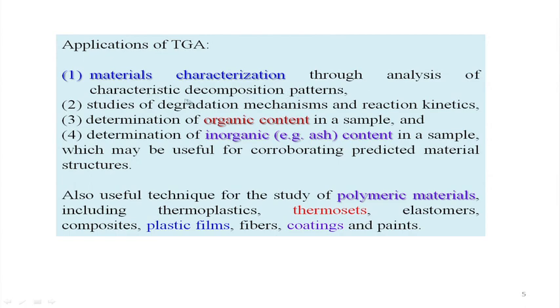So, it can be characterized for its different decomposition pattern, like that of your calcium oxalate or magnesium oxalate, we will see. Then degradation mechanisms or the reaction kinetics, those are very tricky processes, but we can also monitor those, what sort of degradation mechanism is happening over there, and the high temperature reaction kinetics at the same time.